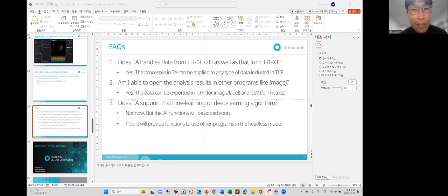Oh yeah, someone already mentioned it, so if I address it again: my TA software has an AI module. By upgrading it, I will lose this feature. I mean, the new software is only based on RI segmentation.